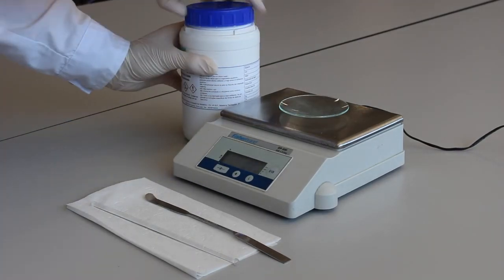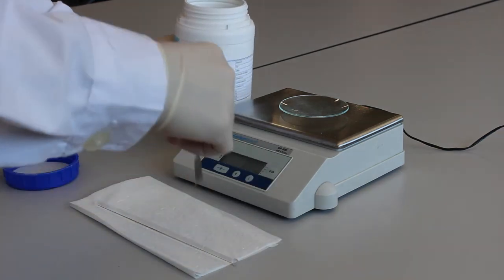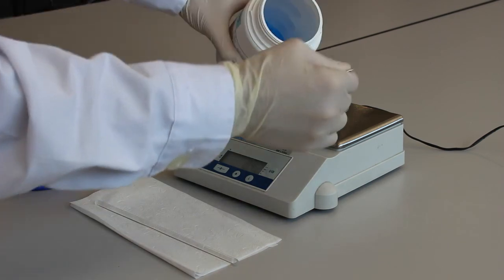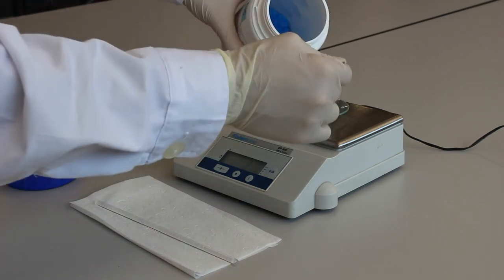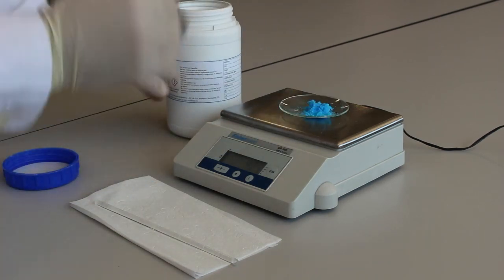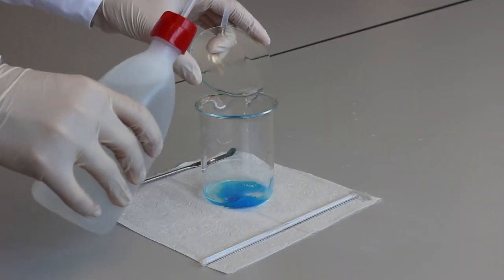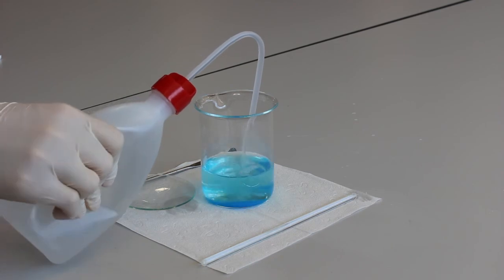First, we used a balanced end spatula to prepare a dilute solution of copper sulfate. We prepared 4 grams of the compound and then added 250 milliliters of distilled water. The simplest ion that copper forms in solution is the typical blue hexa-aqua copper ion.